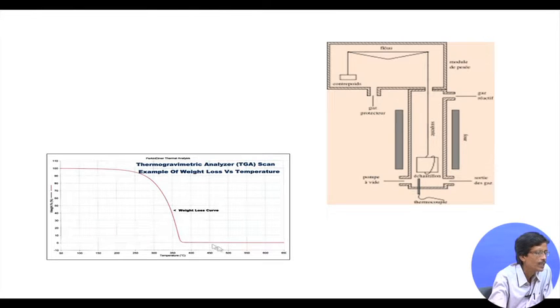What we have just seen is another typical example, again with percentage starting from 100. The instrument doing the analysis is the analyzer, but the analysis is TGA, thermogravimetric analysis. The weight loss versus temperature plot is like this. Here also there is no very discrete or sharp staircase-like arrangement, but a continuous weight loss curve. Beyond 350 degree centigrade, at 375, 400, 500, 600 and 650 degree centigrade, from 400 to 650 degree centigrade we do not see any weight change.